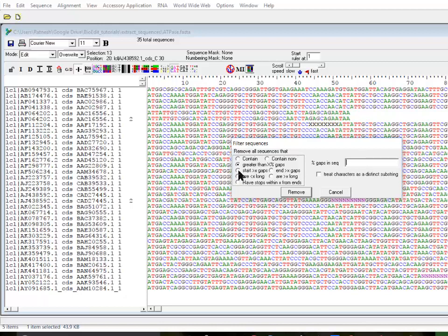You can also use the option where you can say if the sequence has this many gaps in the start or this many gaps at the end, remove that. These are very useful in alignment. Sometimes unrelated sequences end up showing a lot of gaps because they don't align well and those are troublesome sequences, so you can use these options to remove them.